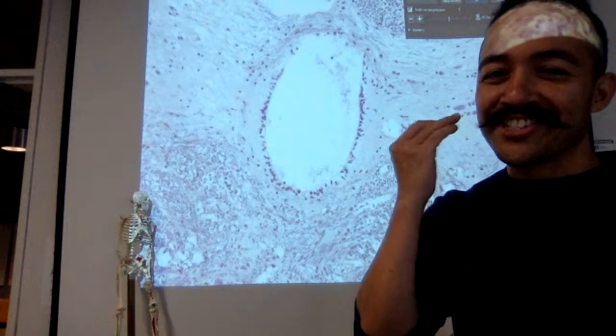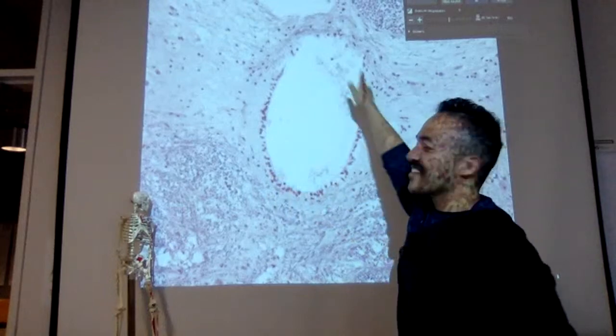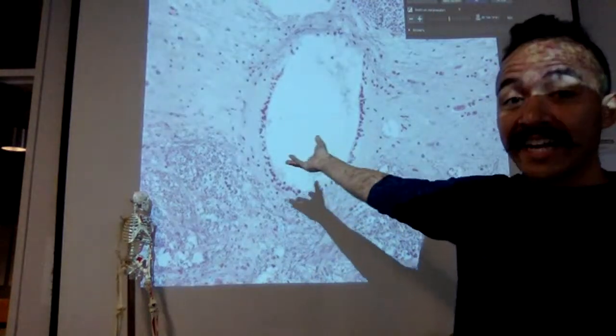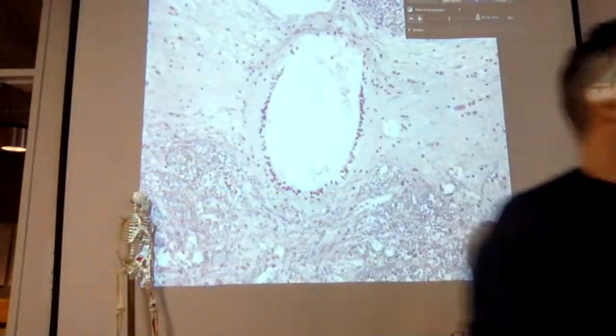Yeah, Isabel, good job. Ependymal cells, yeah. These are ependymal cells lining the central canal. Whether we're in the brain, which I'll show you coming up, or in the spinal cord, if it's lining a space, a fluid-filled space, those are ependymal cells.